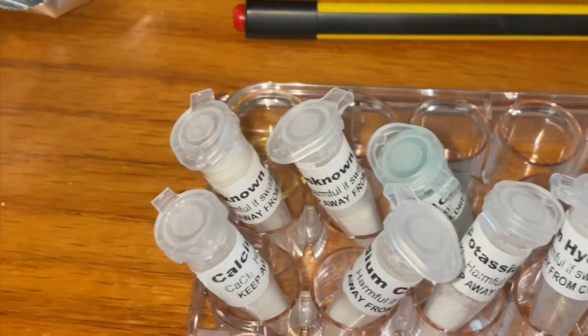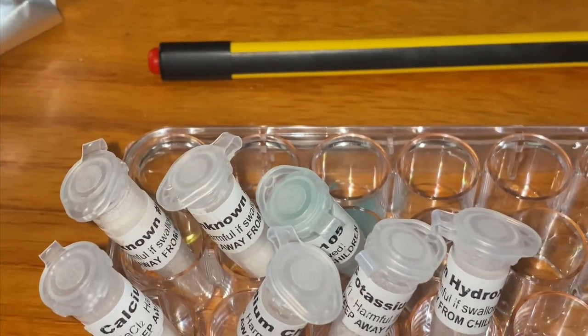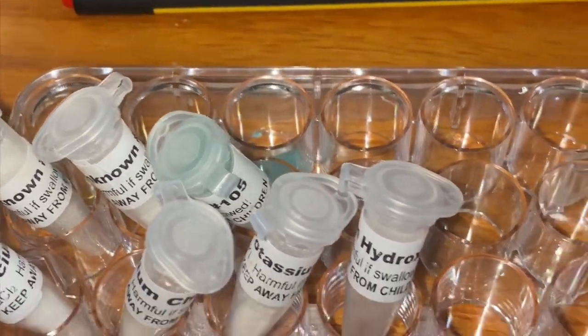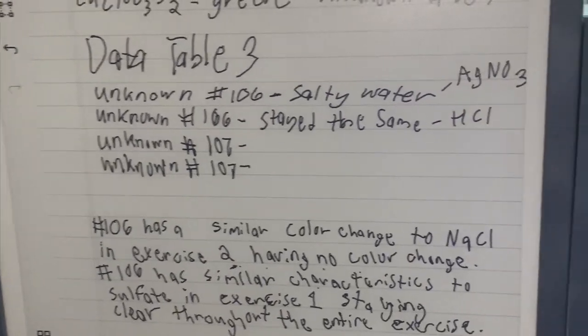We are finished with lab 1, anions, cations, and ionic reactions. And this is our results. So thank you and have a nice day.